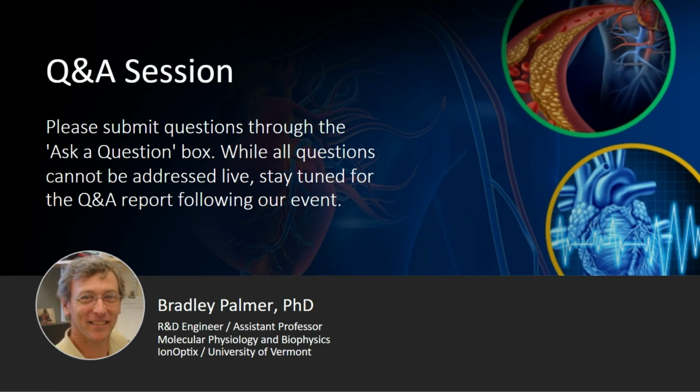Sam asks, can you use ischemic cardiac tissue slices? Yes, you can use ischemic cardiac tissue slices, but as I had mentioned just a minute ago, you've got to be careful. Wait, ischemic. I'm so sorry. We actually have. I was thinking infarcted. I still had infarcted in my brain. I'm so sorry. Ischemic, yes, absolutely.